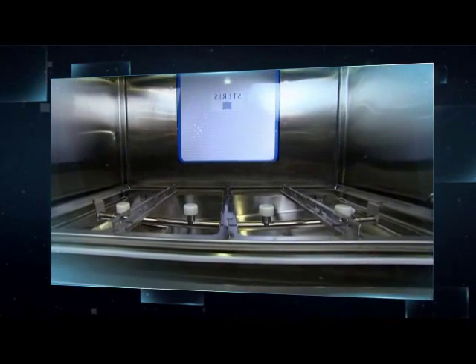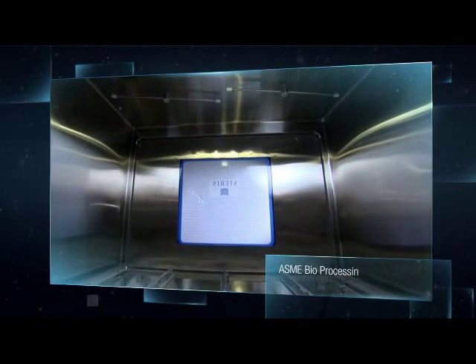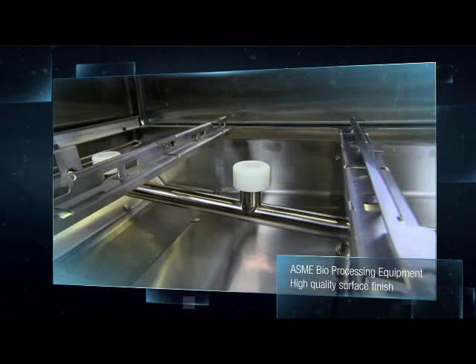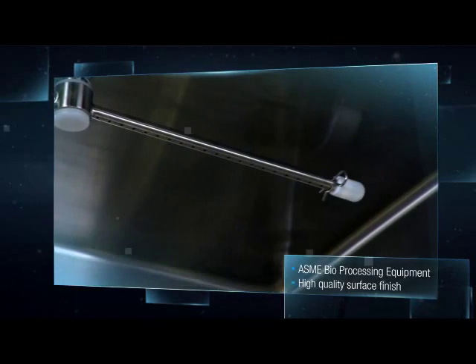The new 480PG washer's sanitary design complies with the ASME bioprocessing equipment standard to prevent the risk of cross-contamination between loads. All welds are polished to achieve a high-quality surface finish and dead legs are limited to the strictest minimum.